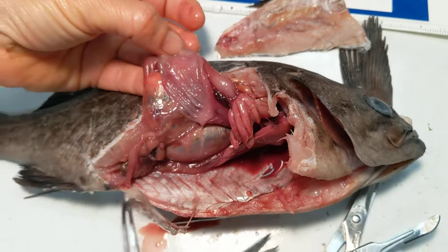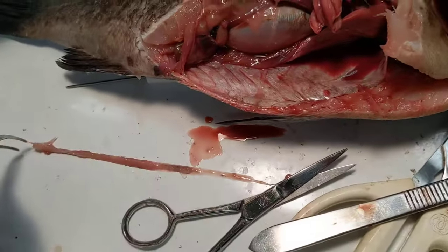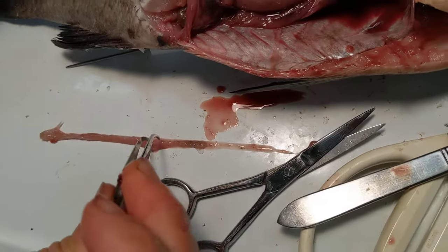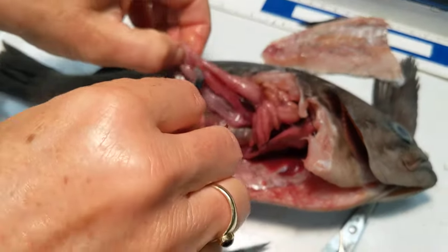A worm! So there is a worm in here. These guys are pretty omnivorous. So nothing else good in the stomach.